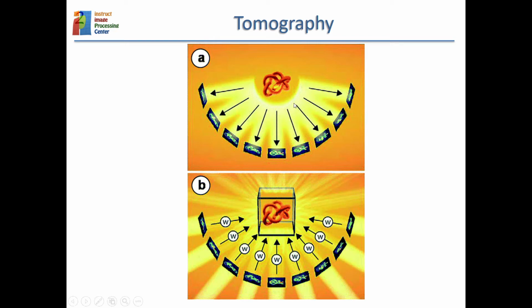Okay, so let's see what the tomographic problem is. The microscope had an object inside, or infinitely many objects of the same size and the same shape, and then it has generated projections. And then computationally, we have to take those projections and place them back into the 3D object. So the microscope is going from 3D to 2D, collapsing all the 3D information into 2D images, and we have to uncollapse that information into a 3D object.